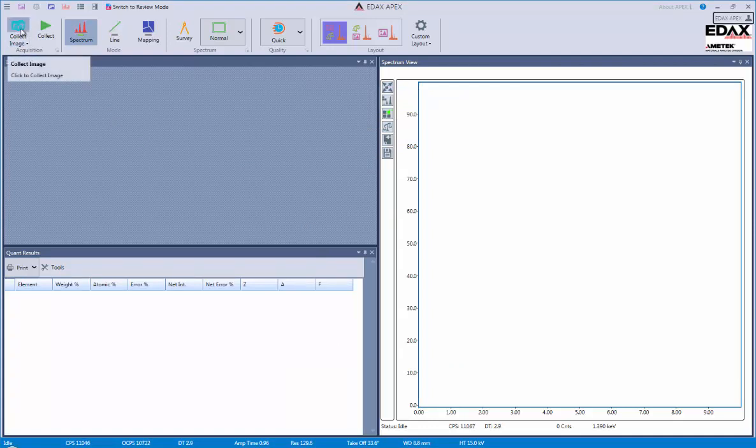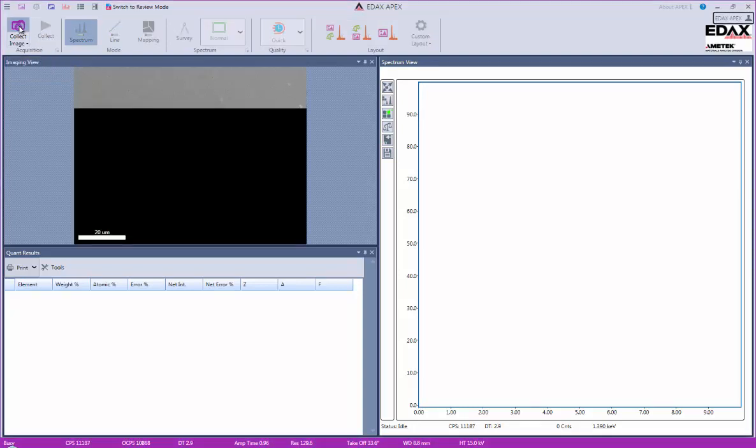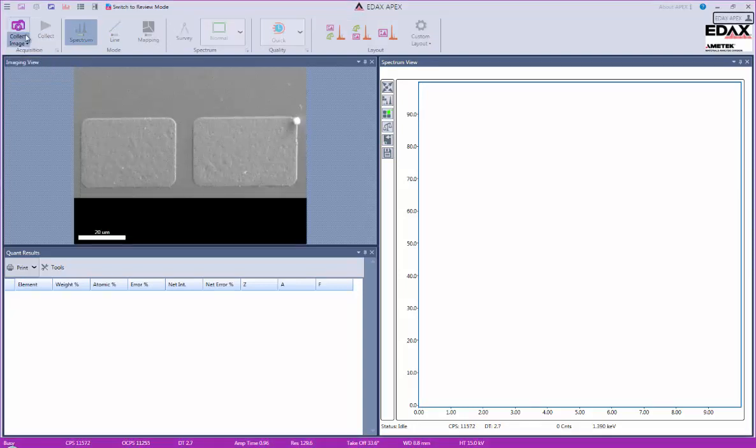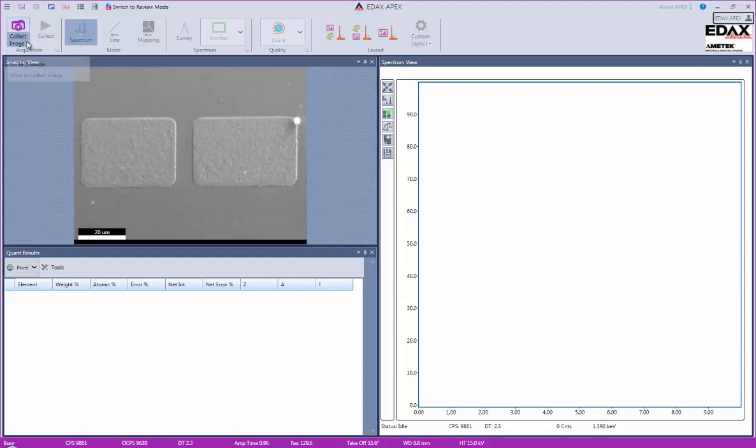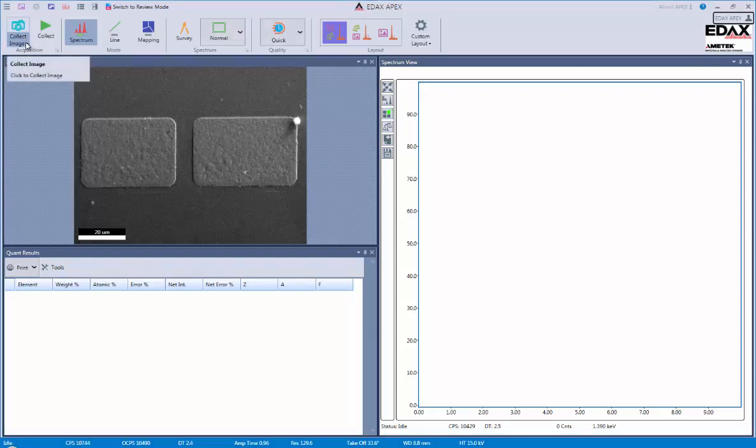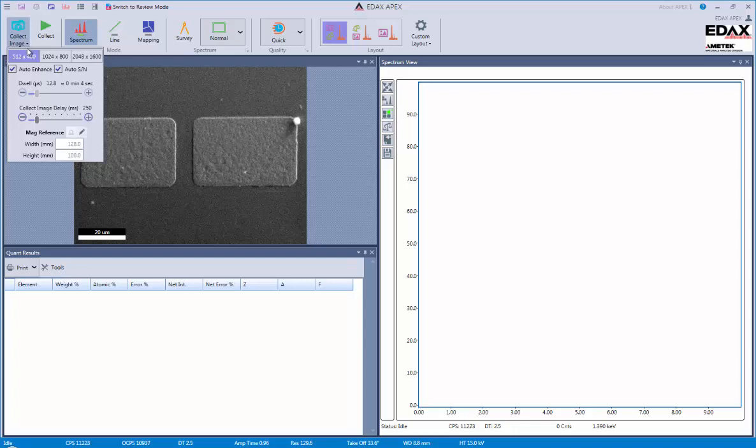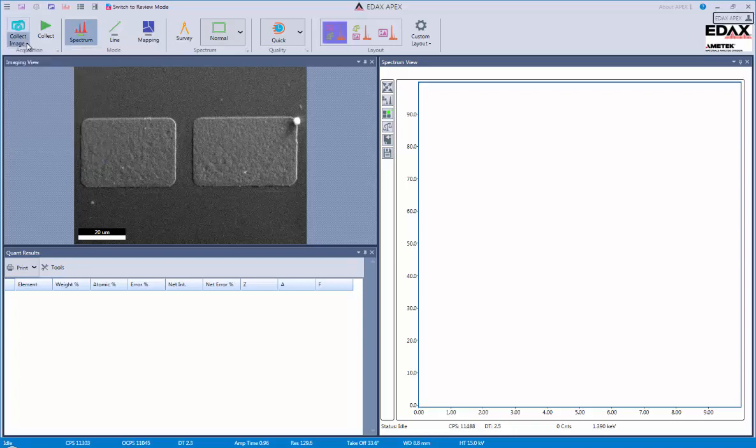This is where we'll be using the most commonly used functions, such as collect image. In order to collect the image, we just click on the camera. If we wanted to have a little bit more control, we could click on the collect image with the arrow and have some customized functions available to us.